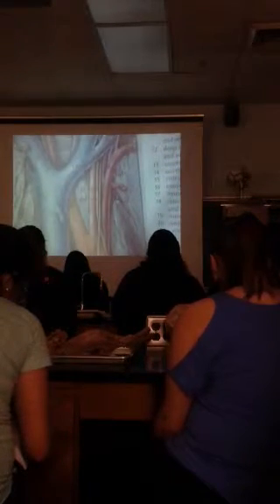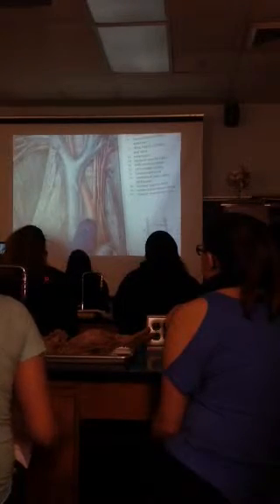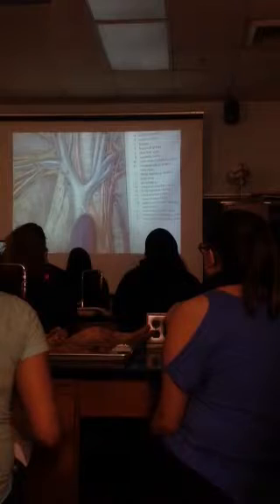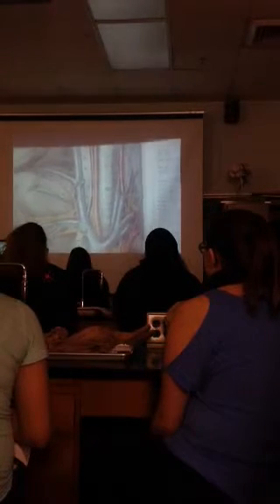Okay, so what you need to remember for cat, the two differences are the VCT, and then when you come up here, having that brachiocephalic trunk, and off of brachiocephalic will be the left common carotid, the right subclavian, and then off of that will be right common carotid.